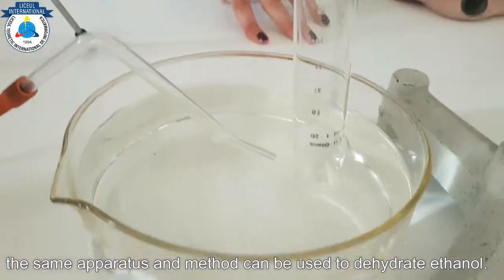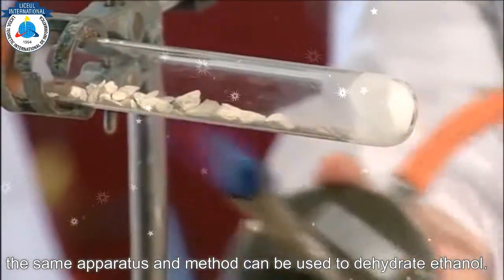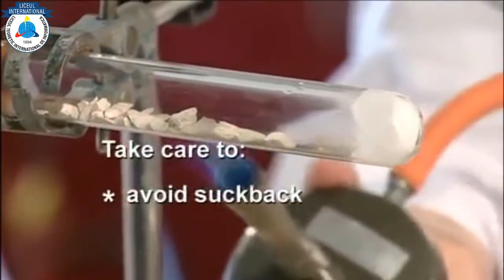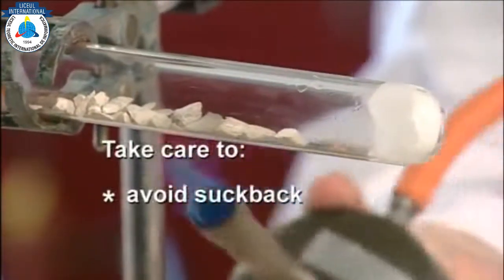Drop in the paraffin, then heat the pumice stone for about 10 seconds. For every second that you're heating, it can cause the boiling tube to crack. It's vital to watch the delivery tube.